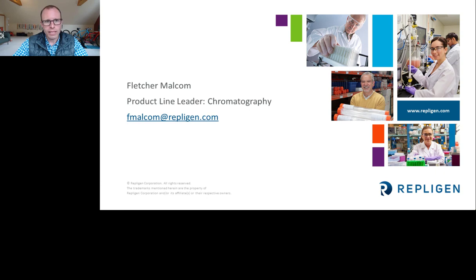So it could be done. I don't think it needs to be done. It's a little bit different story if the columns have been used in GMP production and then put into storage and then pulled back out. In that case, we do see end users often testing for plate count asymmetry after storage and also doing sanitization cycles and then subsequently testing for bioburden.